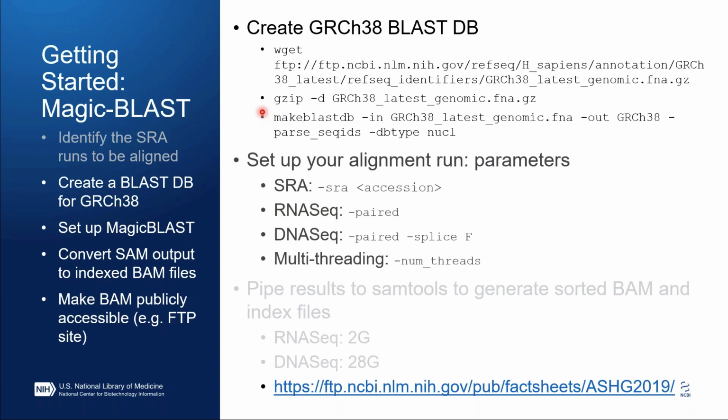Now, generally, if you're going to run Magic-BLAST, you can do this with default parameters, but there are a few parameters that it's worth making mention of here because these are ones that you'll want to pay attention to.